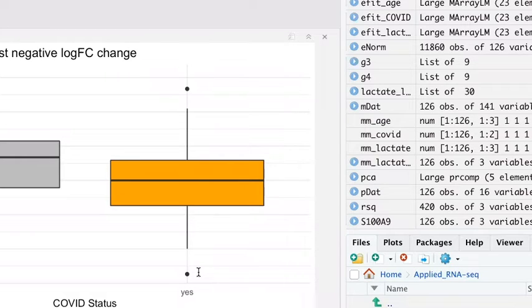So if you do remove these outliers, which you definitely can, you can very clearly state that we do have outliers, and there might still be a lot to say about this data when you want to go forward, publish, or just present it. If you remove those outliers within your normalized data set, then you have to normalize it again. But that might also be cherry picking.